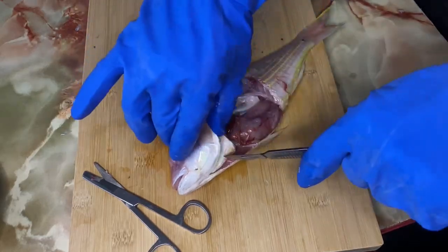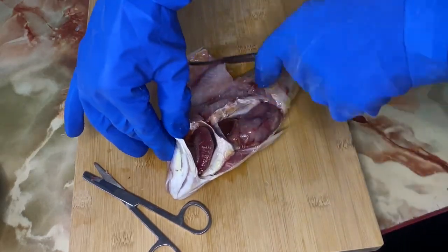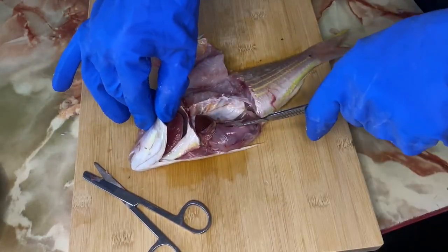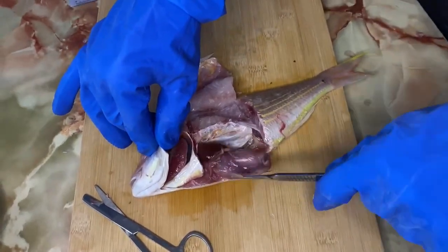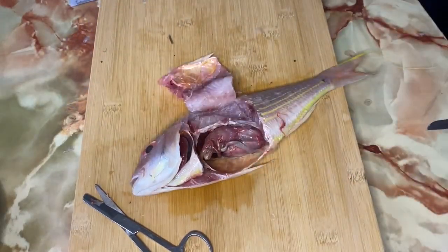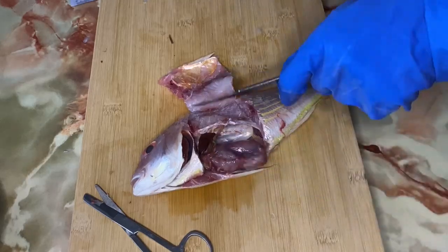By doing so, all the organs in the fish are now exposed. I will then proceed organ by organ to search if there are any parasites present. Thank you very much for watching.